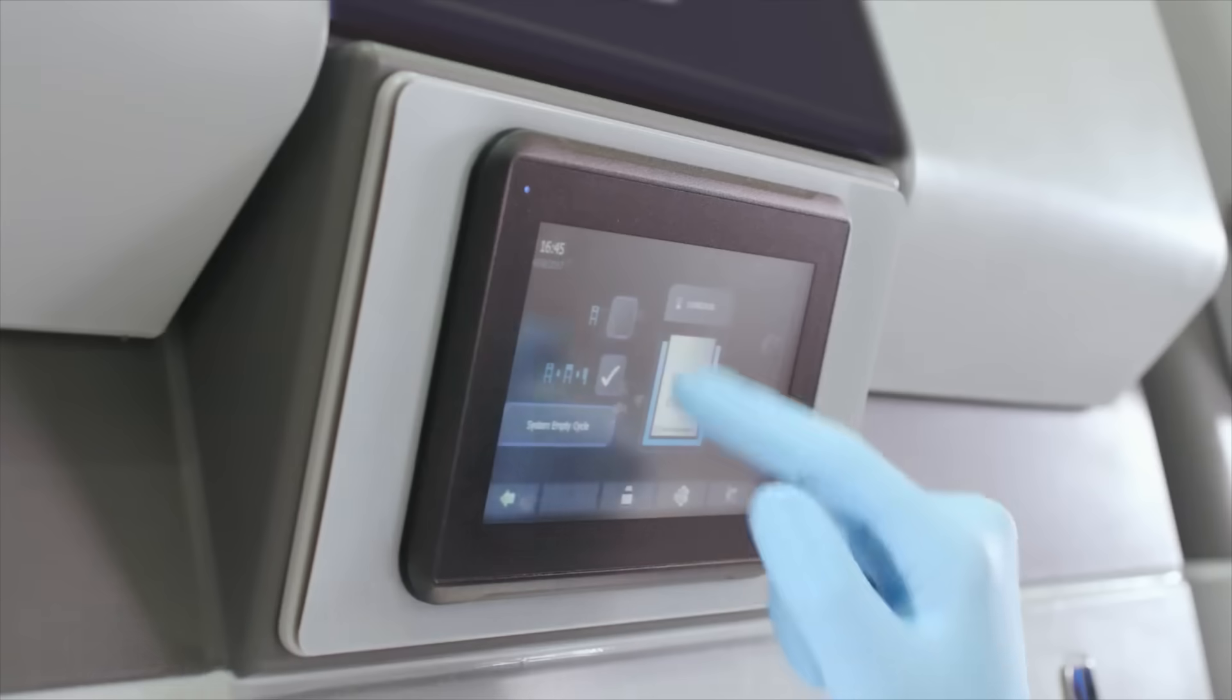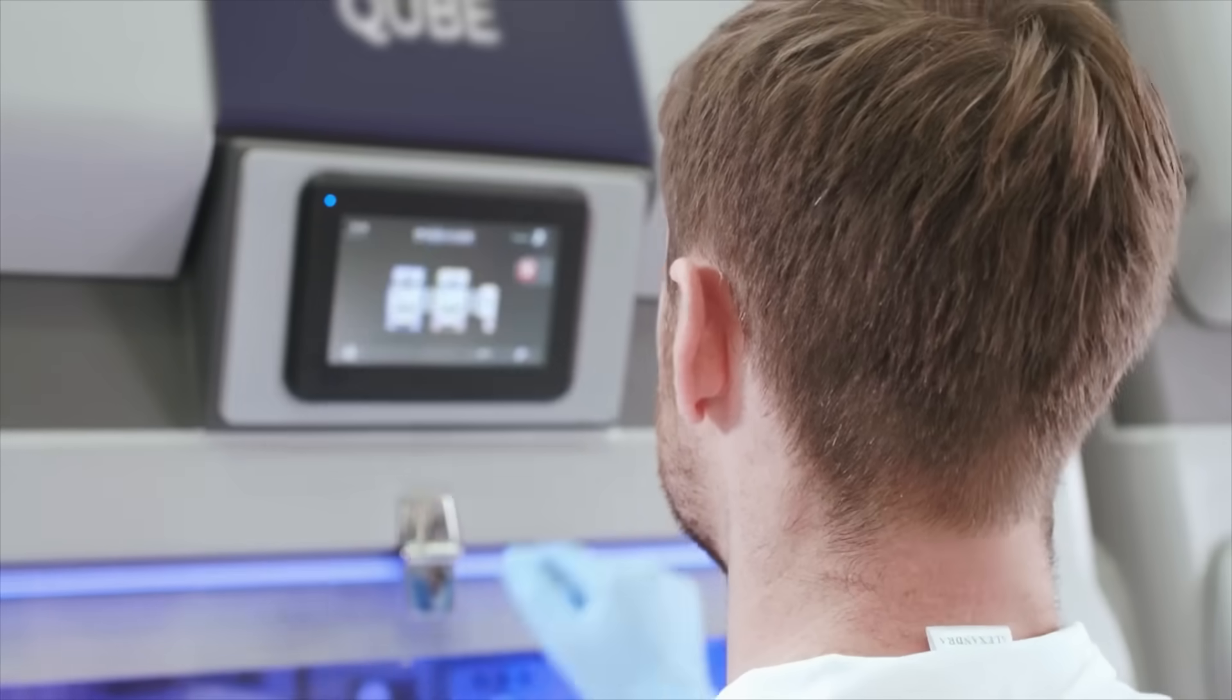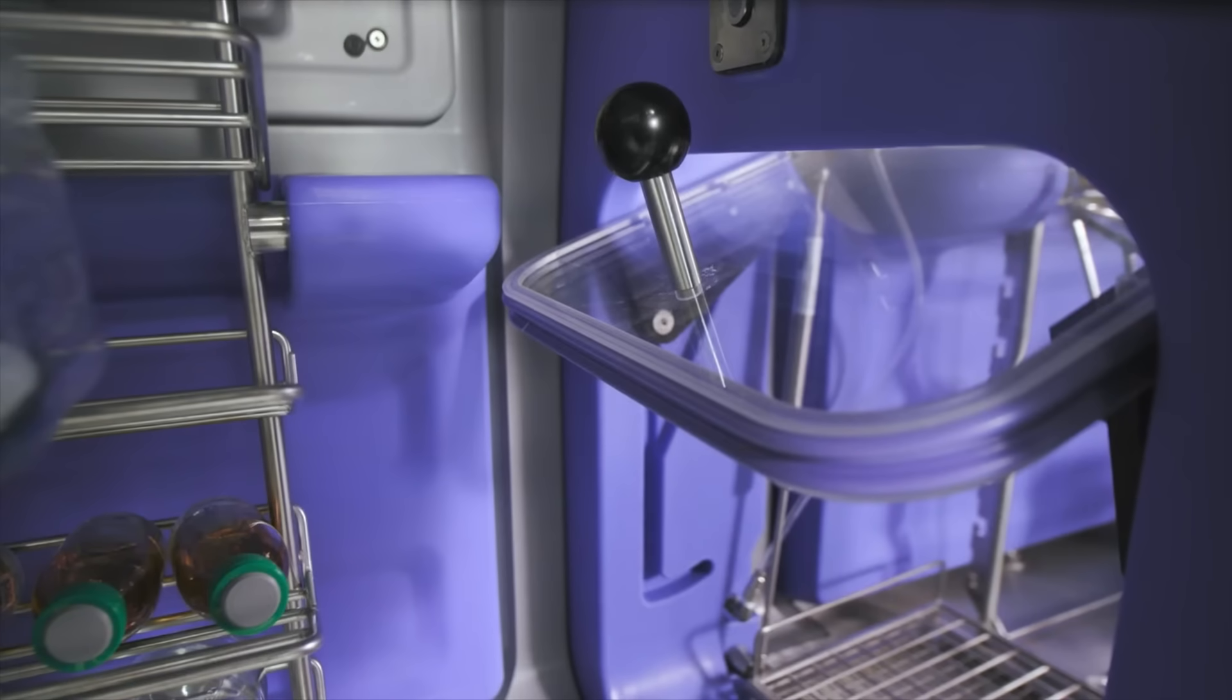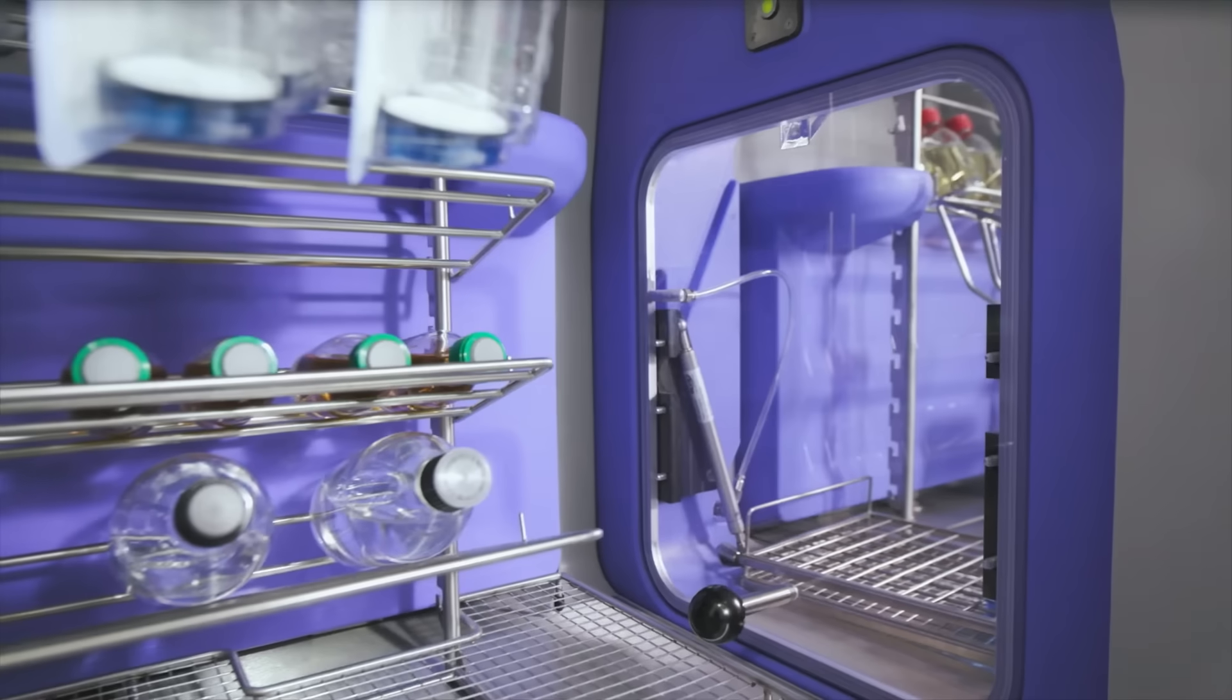Start with a simple to navigate touchscreen to begin a validated decontamination cycle that reaches throughout every chamber. Close the latch between the chamber containing the vaporizer and the adjacent workstation hosting the sterility pump.